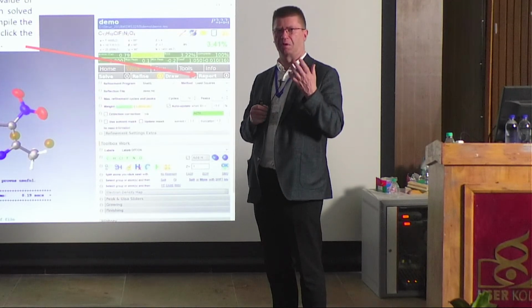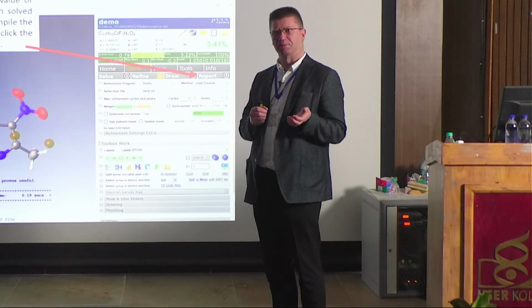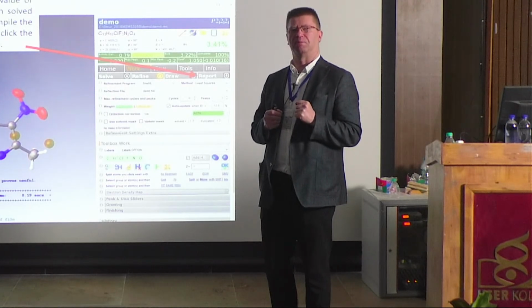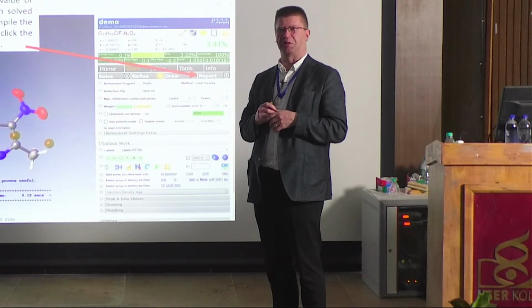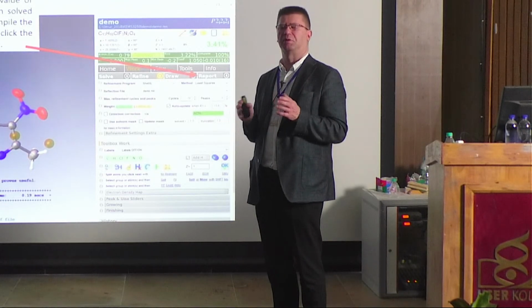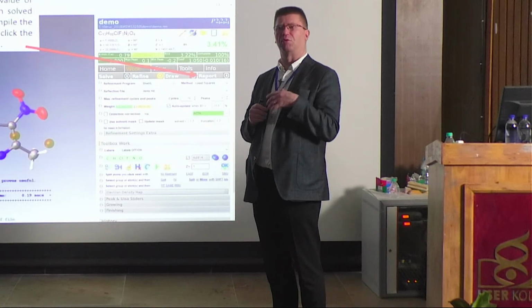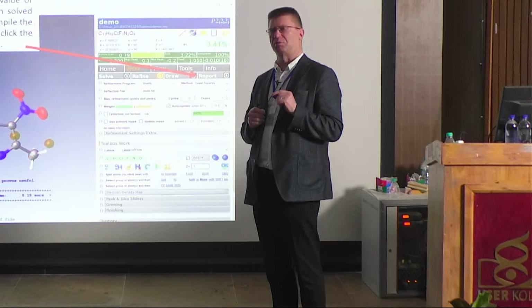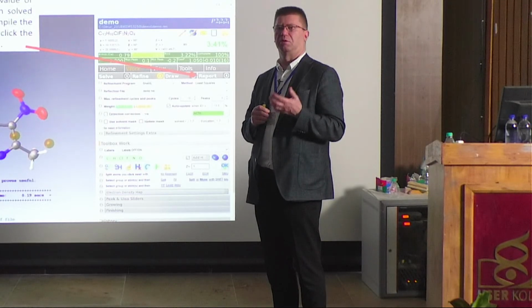Sometimes the X-rays are not telling you the real story. There might be an incorrect atom somewhere, as you noticed yesterday, that the program was giving you something and it might not be correct. So you have to see for yourself that it's chemically reasonable. These things happen sometimes: the X-ray diffraction doesn't know the atom types and can give chemically incorrect answers, or the computer program, like yesterday, I asked it to calculate hydrogen atoms, and in normal cases it works perfectly. But sometimes this happens and it miscalculates something. So it's up to us to check that it is correct.